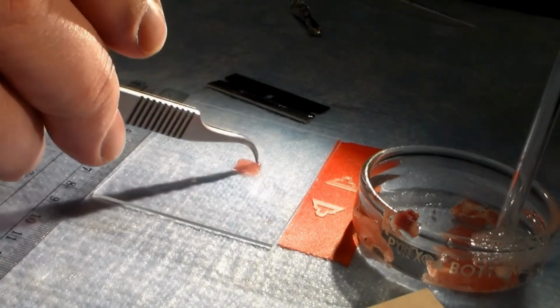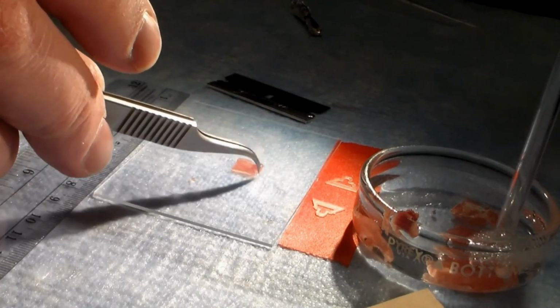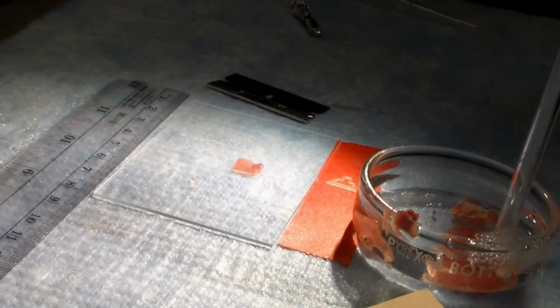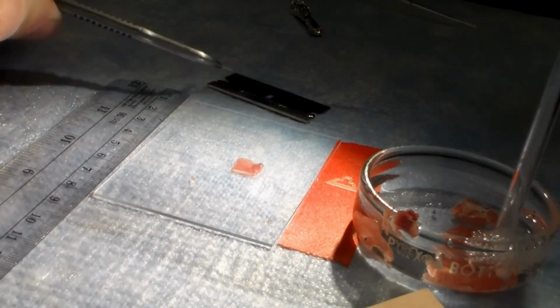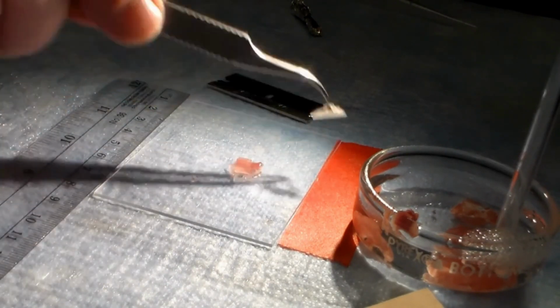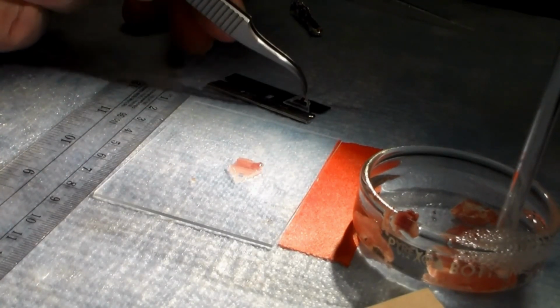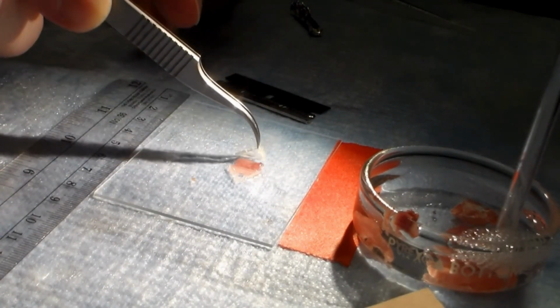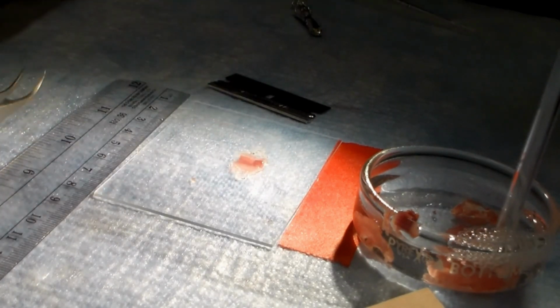And then we'll pick up these clips, dip them into the glue, dab off any excess glue, and then just place one onto the slice on one end. Again, putting the glue on it, dabbing off excess glue, and then putting it on the slice. And again, it only takes seconds for the glue to adhere to the cardiac slice.